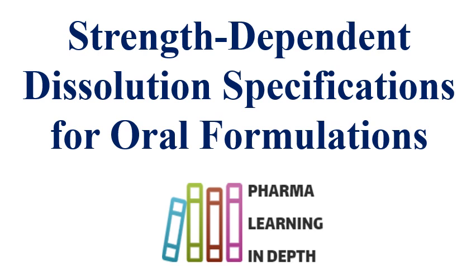As per the regulatory requirement, dissolution specifications are required to be product specific, and these are also required to be strength specific. These are required to have the discriminatory power. So it becomes necessary to understand the dissolution specifications which are strength dependent. Different strengths behave differently in dissolution testing and have different release profiles.